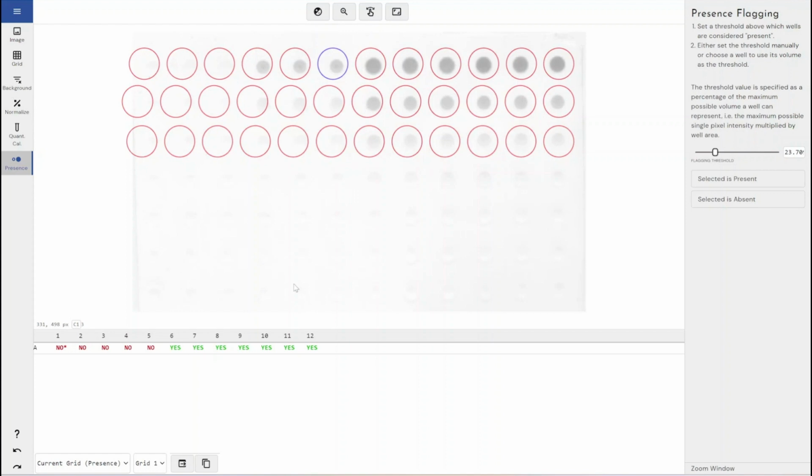So if you're doing a binary experiment where you want to see if it's positive or negative, rather than analyze an intensity or an accurate color change, you can use this. So things like bacterial growth, whether there's the presence or absence of an antibody or a protein or something within your sample. That's the kind of instance when you would use this feature. So you could say whether it is present or absent within your experiment.